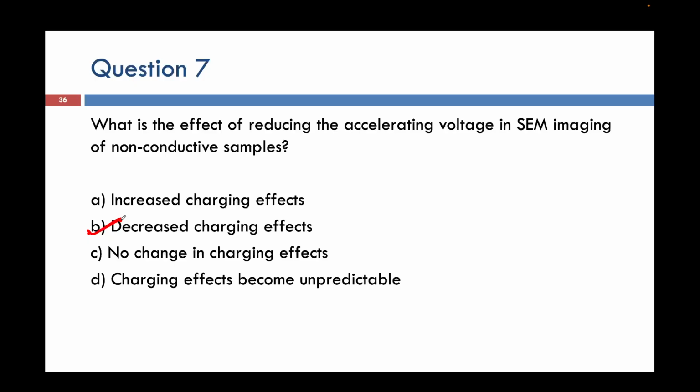Let's say this is my sample. For the first scan you have an artifact here, right? When the scan happens and the charging takes place, this is your sample at the first look, but when the scan happens, it will start to distort, so you will know that the charging is happening.